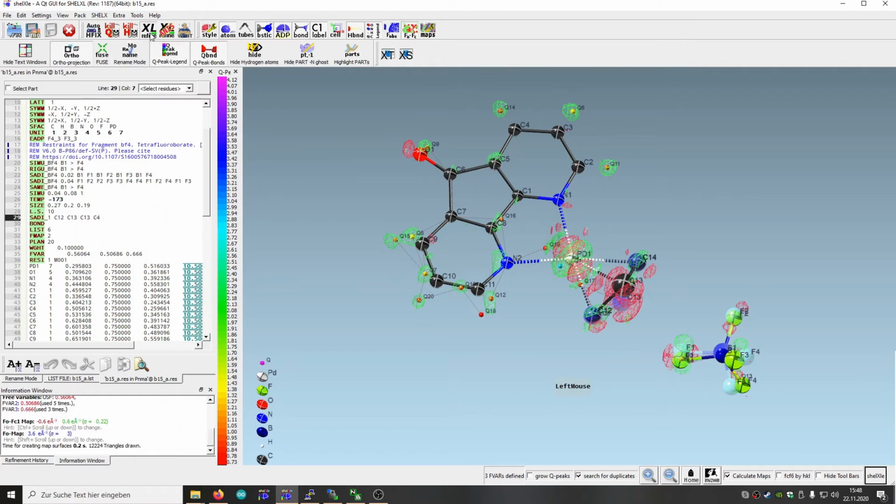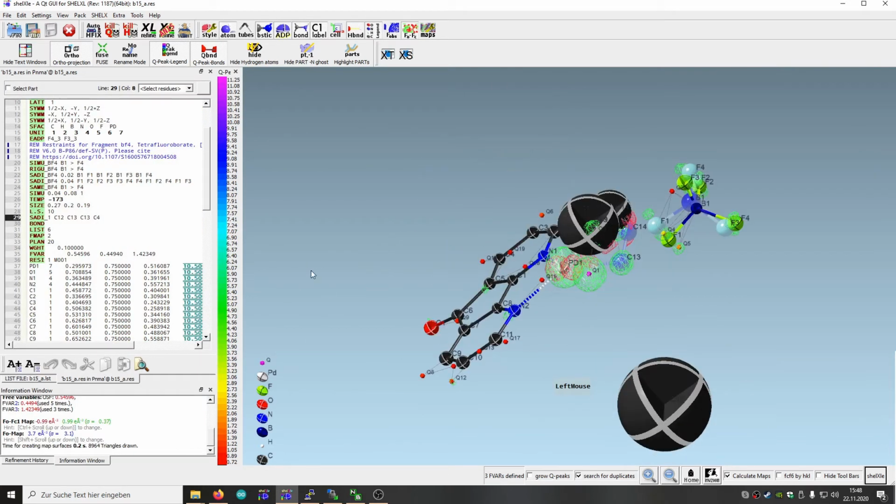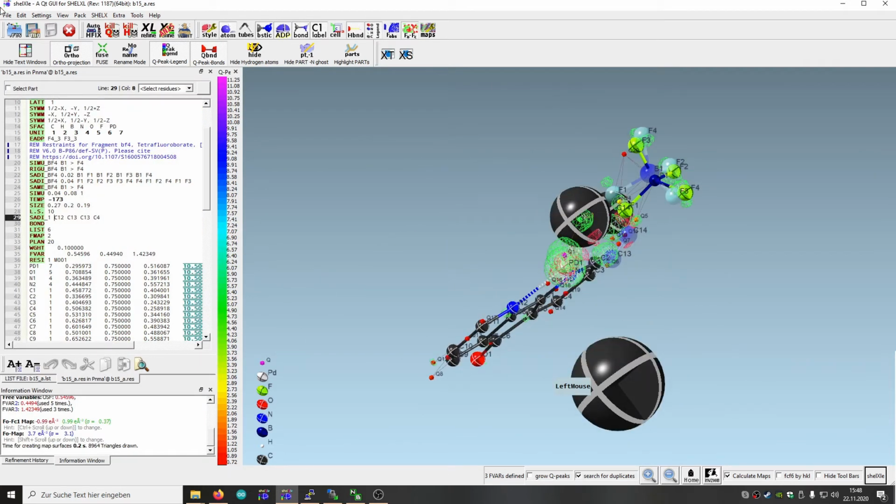Let's see what happens. Oh, that doesn't work. Yeah, we see that doesn't work, and so that's not a big issue.